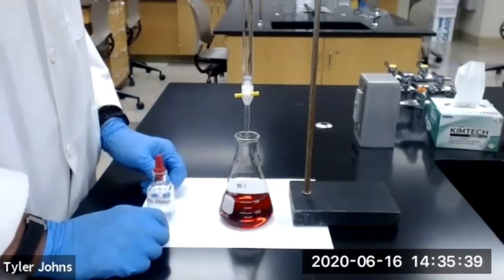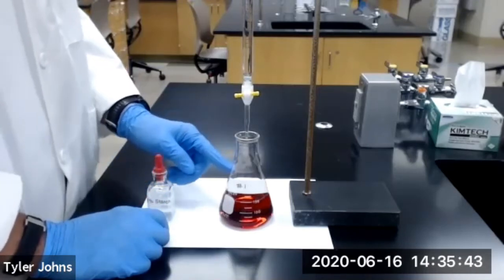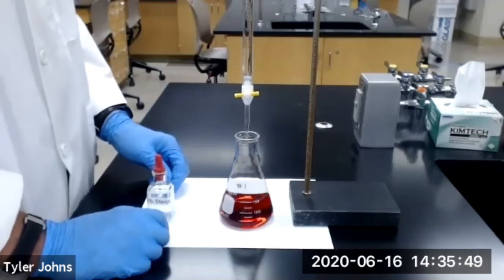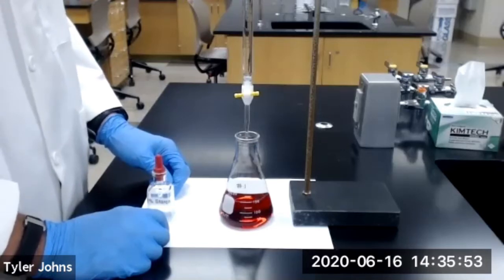We're now going to immediately titrate Erlenmeyer flask number 1 after mixing. We'll first add 2 milliliters of sodium thiosulfate from the burette into the flask while we swirl to mix the flask.